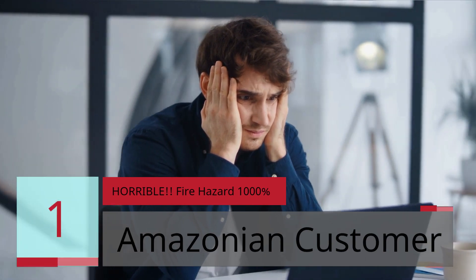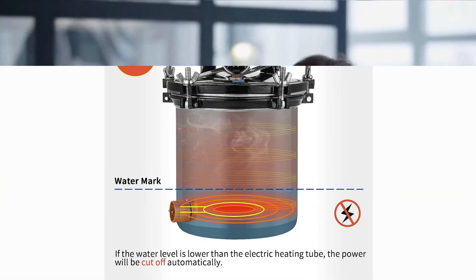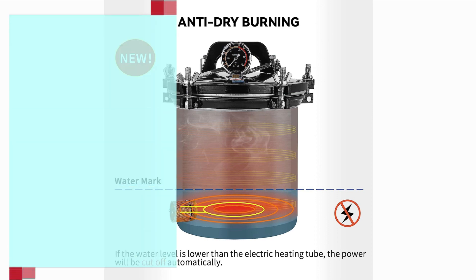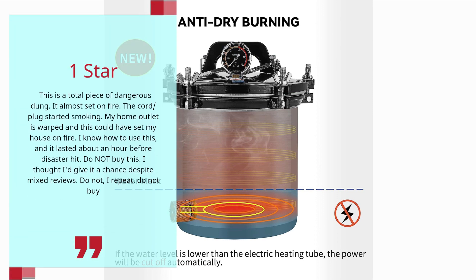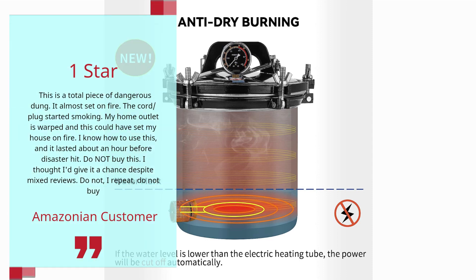Review 1: 'Horrible Fire Hazard' — Amazonian Customer, 1 Star. This is a total piece of dangerous dung. It almost set on fire. The cord plug started smoking. My home outlet is warped and this could have set my house on fire. I know how to use this and it lasted about an hour before disaster hit. Do not buy this. I thought I'd give it a chance despite mixed reviews.